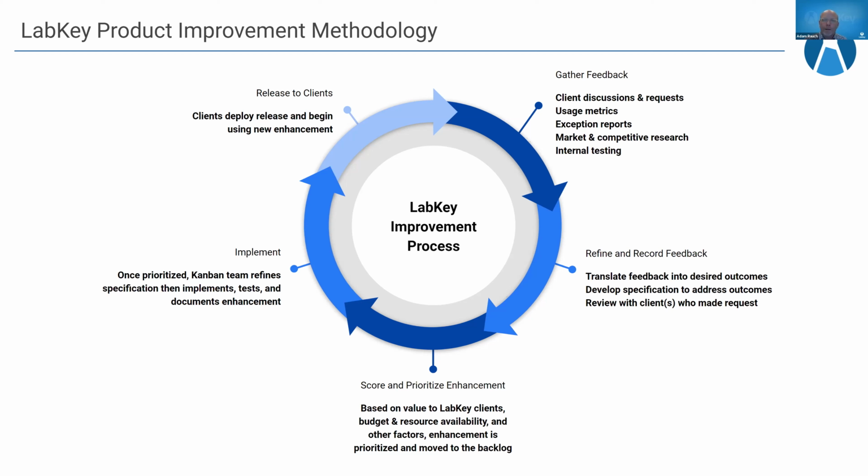So we collect all this feedback, and then we refine it and we record it. We like to translate requests and problem statements into desired outcomes. And that helps us make sure that any enhancement is not only going to address the needs of the single client who may have raised it, but it will hopefully help all of our clients and all of the users of LabKey, or at least a large majority of them. That's what we're always trying to do, to make sure that any investment in this system benefits and has the most impact that it can.